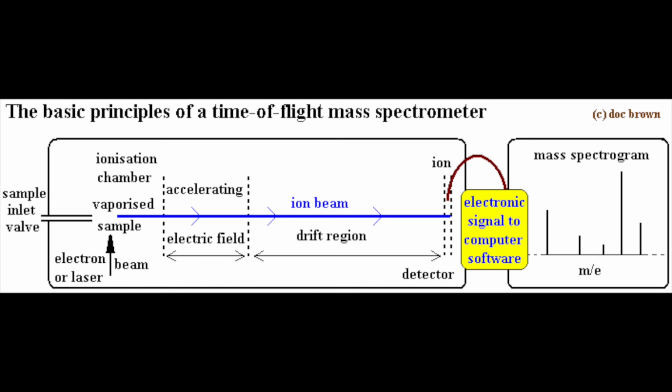Results are then displayed as a spectra of the relative abundance of detected ions as a function of the mass-to-charge ratio. The atoms or molecules in the sample can be identified by correlating known masses to other identified masses through a characteristic pattern.